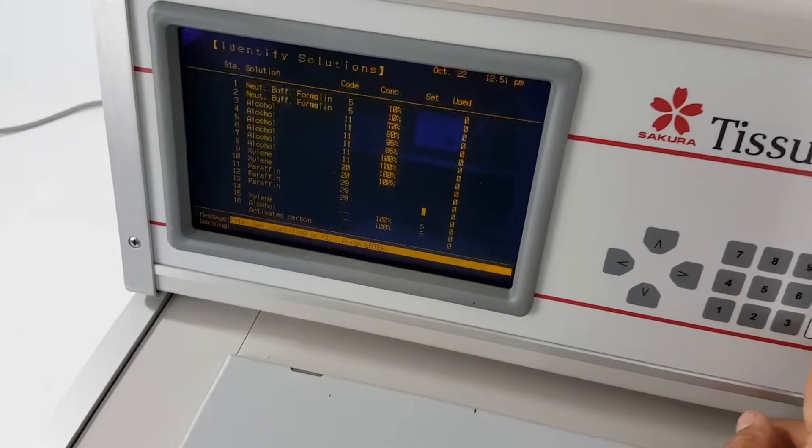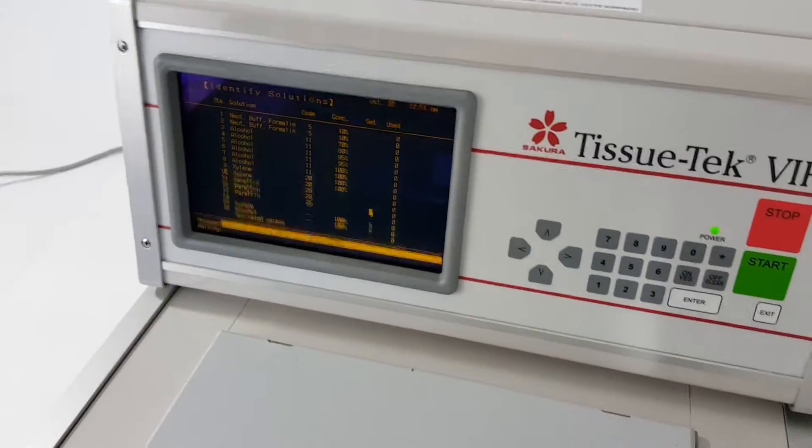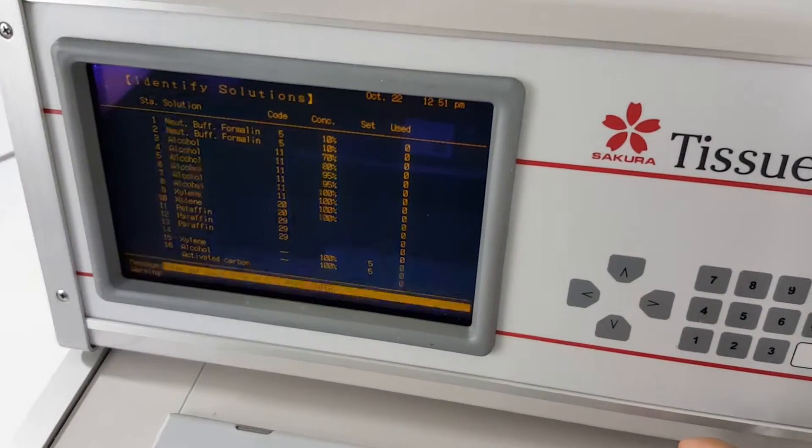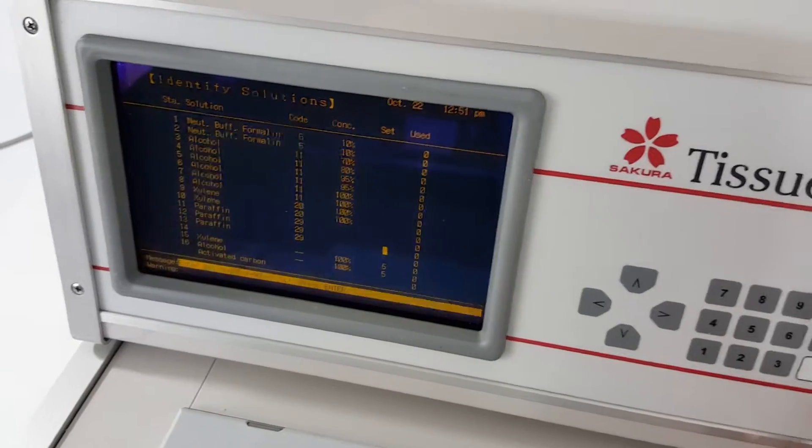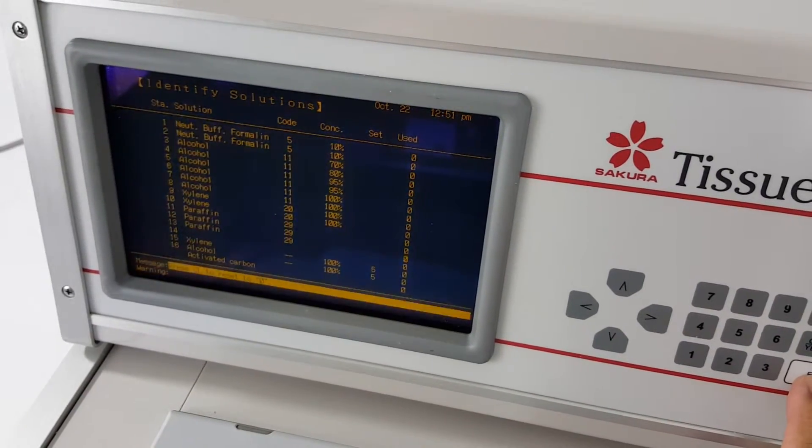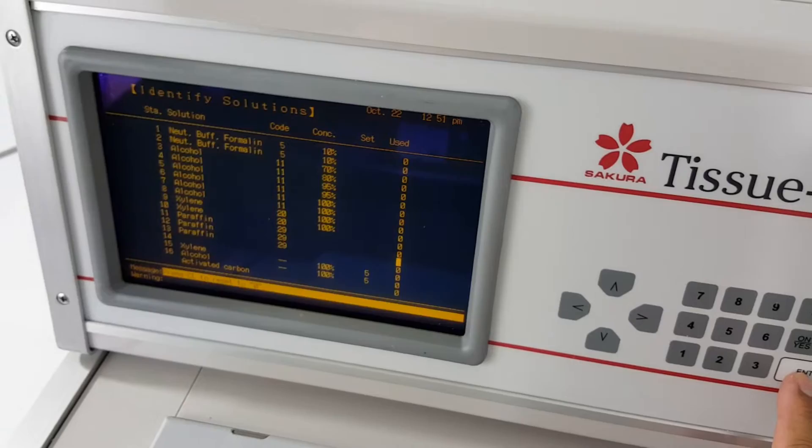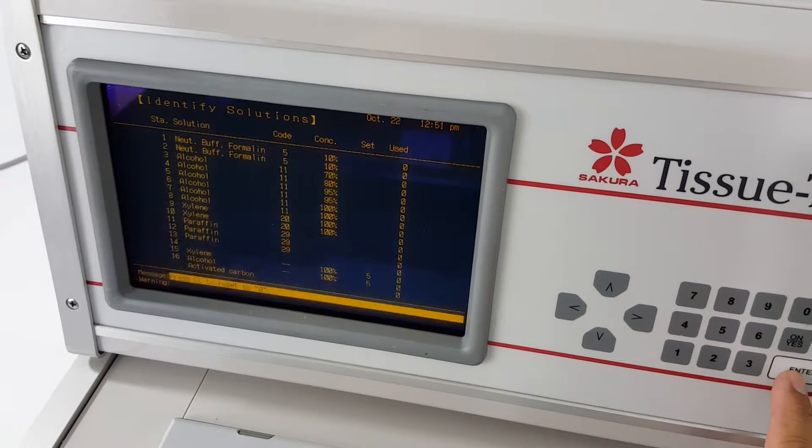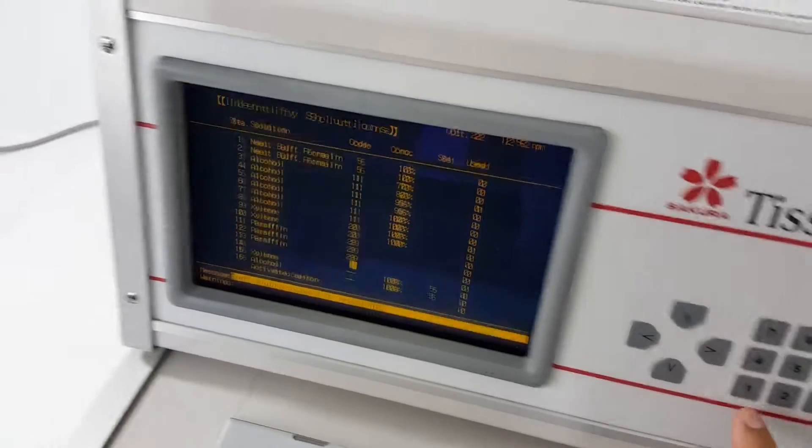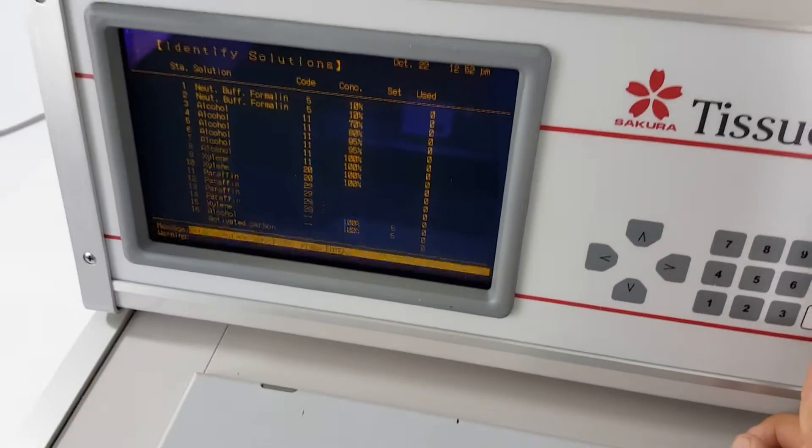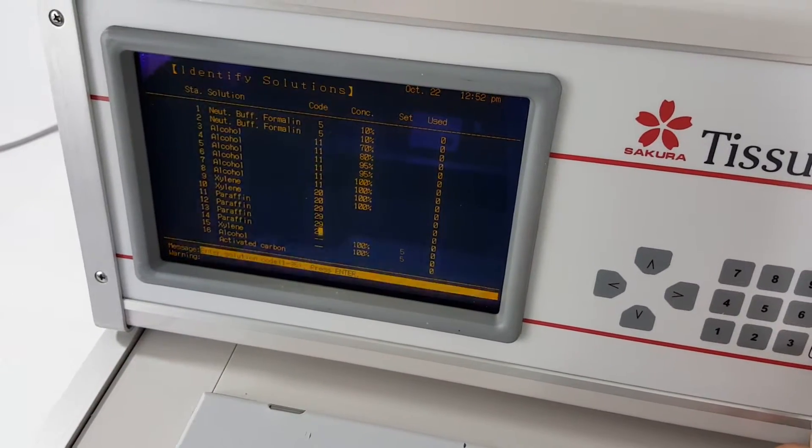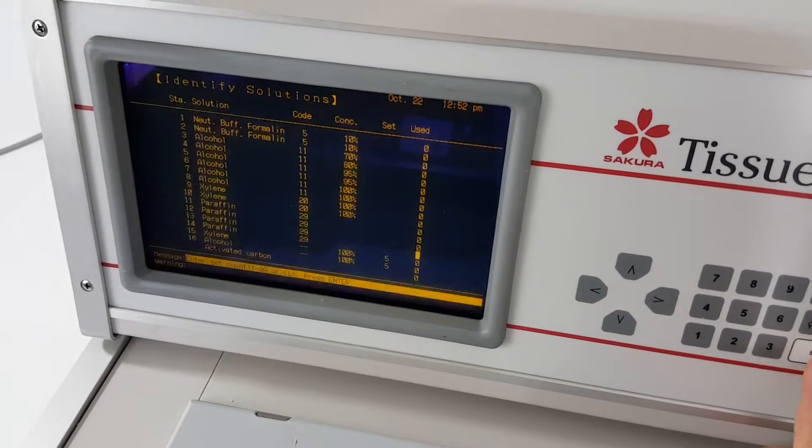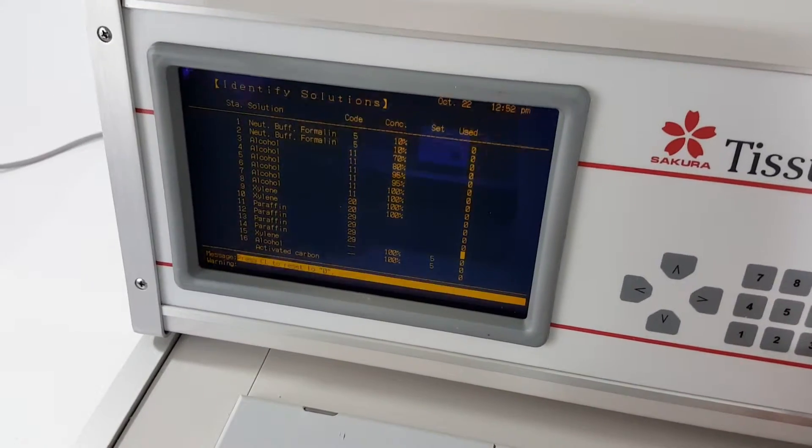Now the E300 and the E150 they're all the same programming style. With the E150 and the E300 it's a little different than the K-series. They have four paraffin containers and the K-series, the VIP 3000, has three. So okay now I'm all set here.